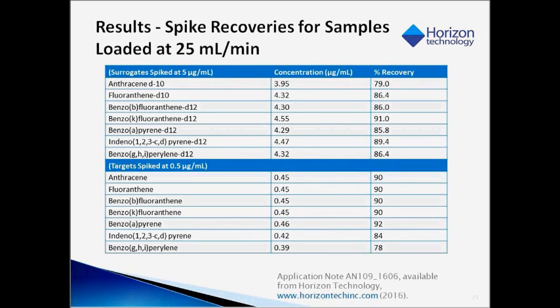The method specified approximately 25 milliliter per minute loading for the sample. For 1 liter of sample, this takes more than 40 minutes. The recoveries are shown in this table.